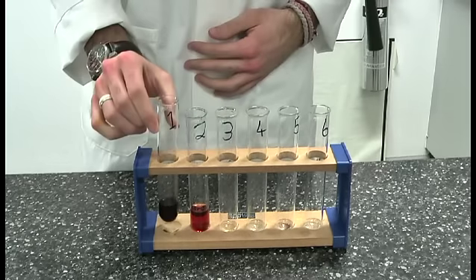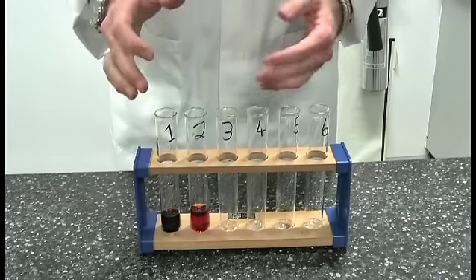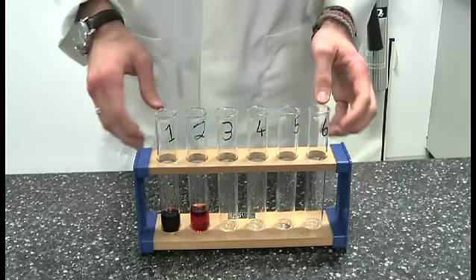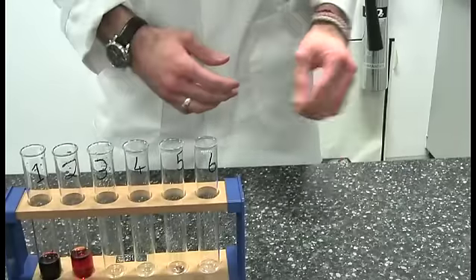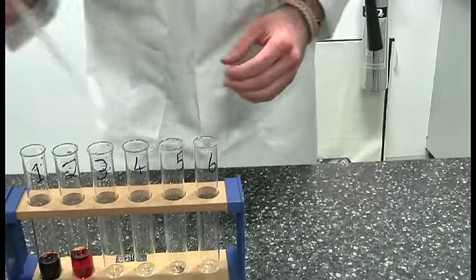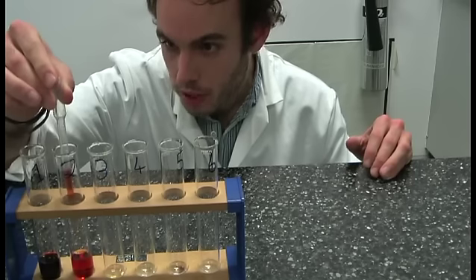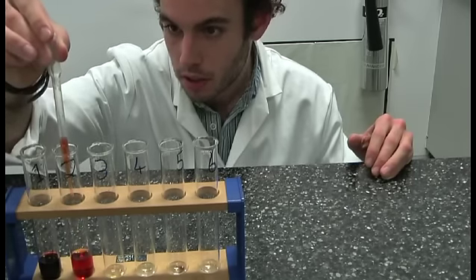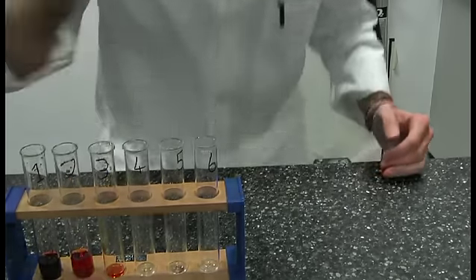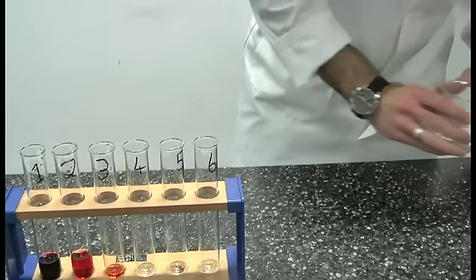So now that we have a sample of stock solution and a sample of 10 to the minus one diluted solution, we can continue with the experiment. Following the same process, you're going to grab a clean pipette once again, measure out one milliliter of your solution from test tube two at eye level, and add into test tube three.